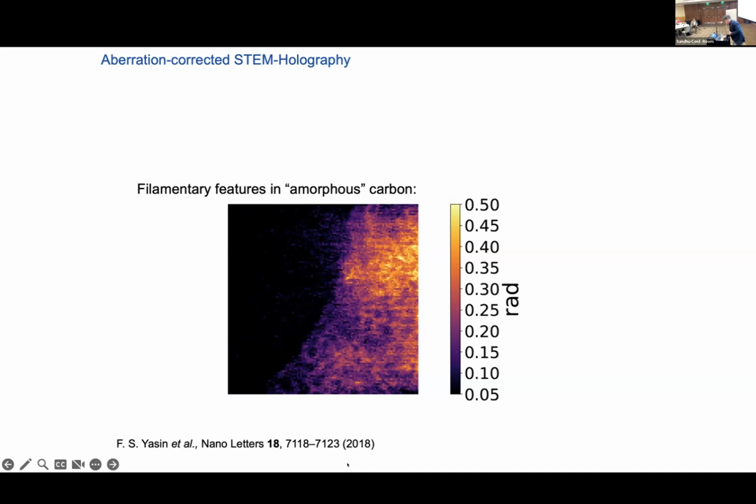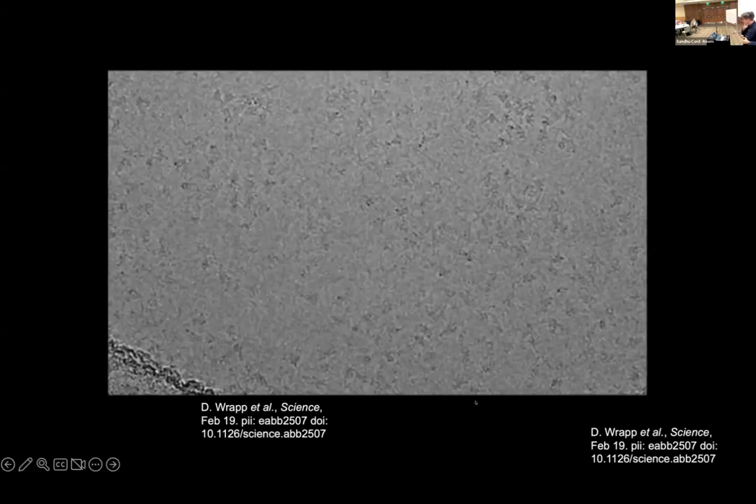Okay. We do some other work with magnetic imaging that I can talk about in a whole other talk. It's another side of the lab. We're routinely using our phase shift, our non-reduced phase shift. For now, I'll just summarize that if we can image these things and either increase the contrast even 10% or reduce the dose required to get this image by 10%, then that's already a pretty measurable and useful feature.